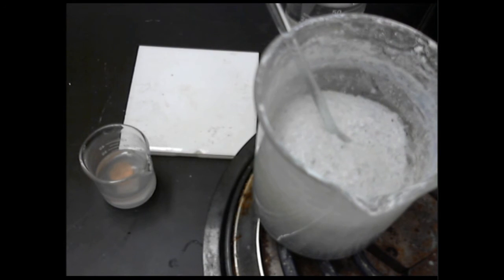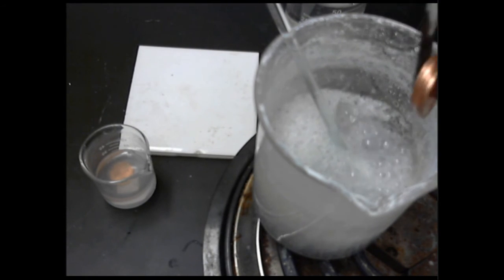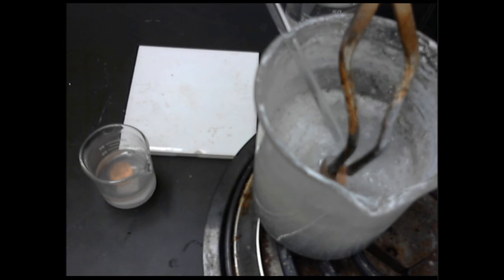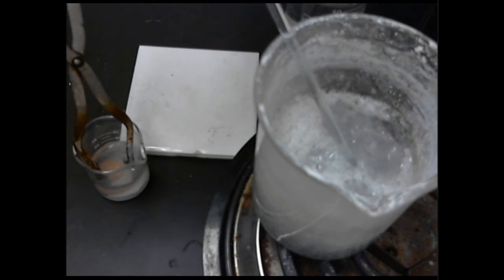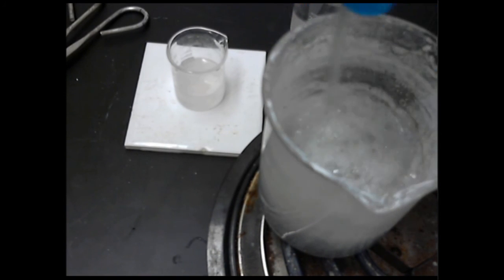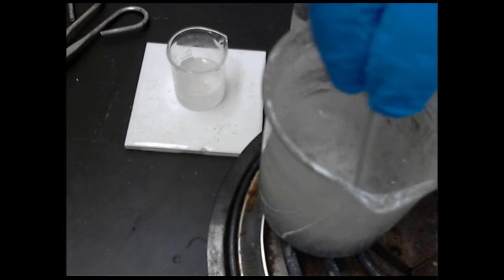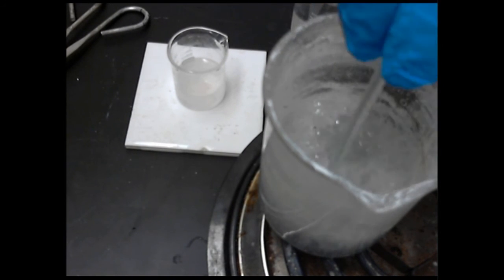I'm going to take these pennies and put them into this boiling bath of zinc acetate dissolved in water with zinc metal on the bottom. The reason I'm doing this is because they're just going to be bathed in ions of zinc, and those zinc ions are going to plate themselves to the outside of the penny. I'm going to stir this really well to make sure that the pennies get mixed into the zinc metal on the bottom very, very evenly.